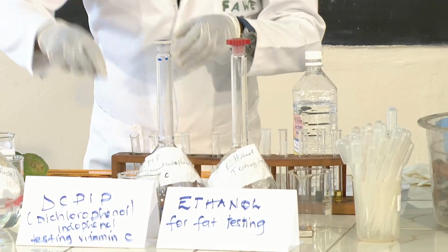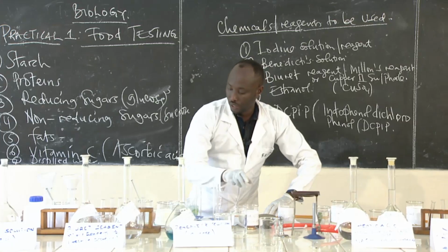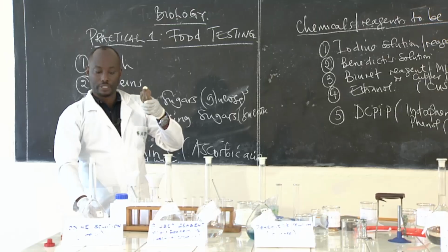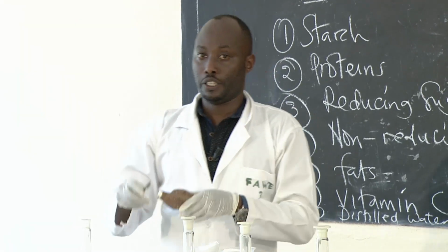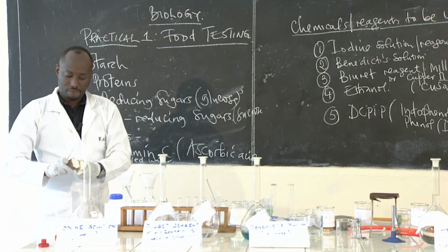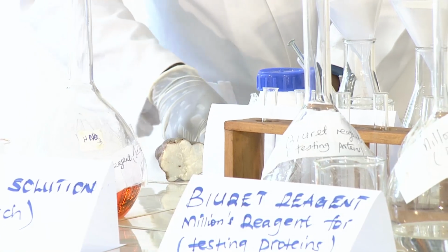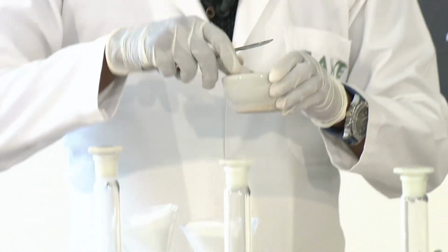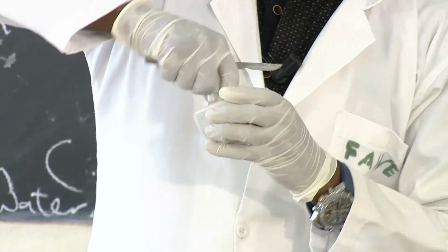Okay. Now, we are going to test for the presence of starch in this one. Will it contain starch? I will use my knife. As you can see, I extract a small piece of it and put it into a mortar. I try to crush it into a paste to see if it gives the same results.